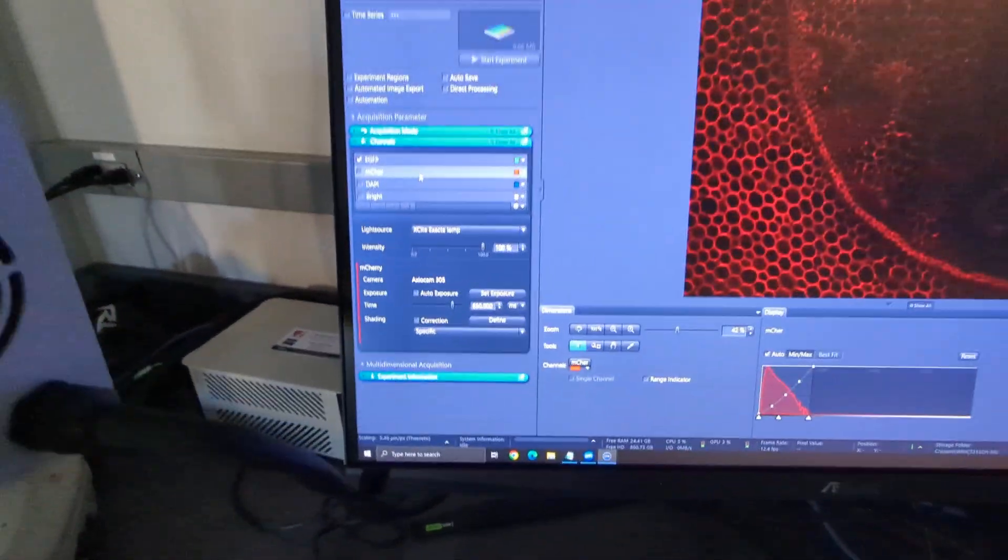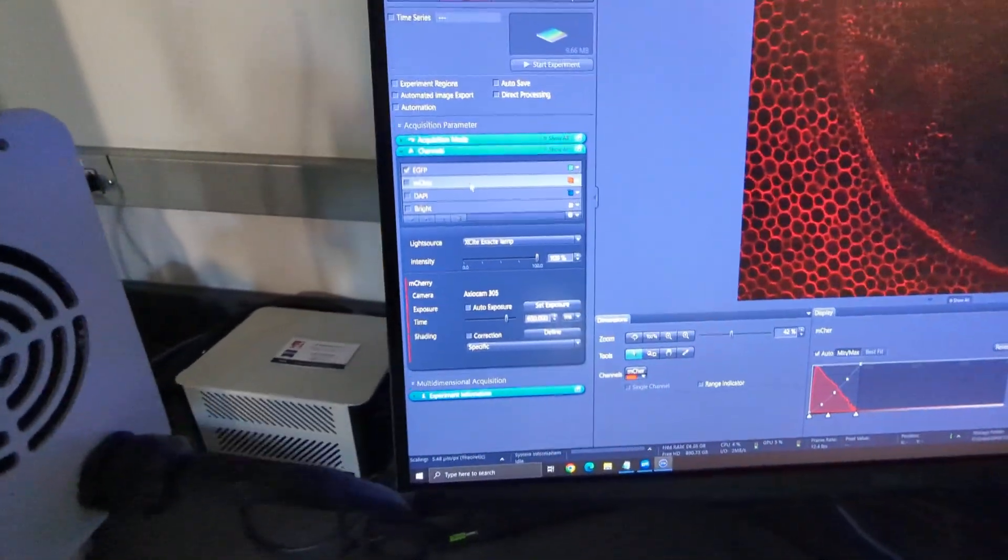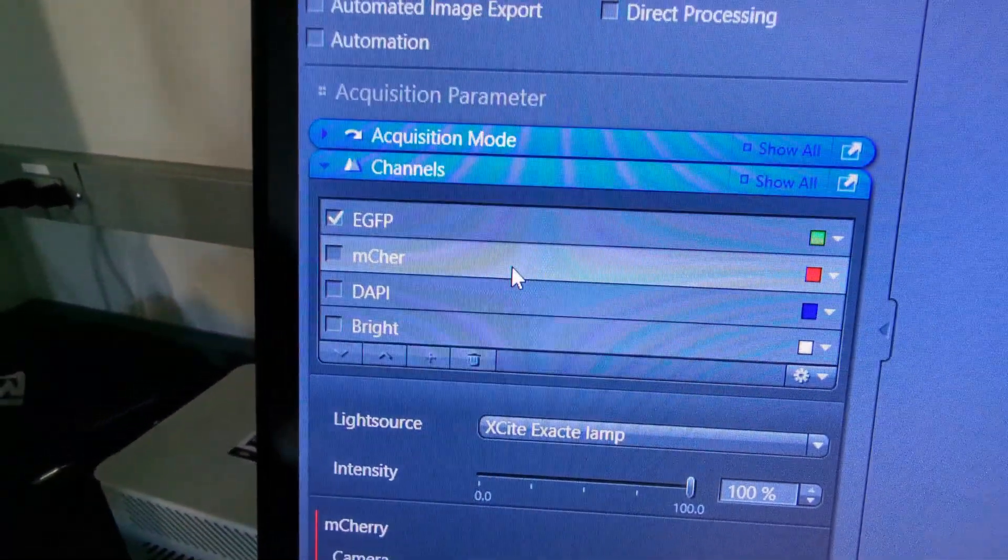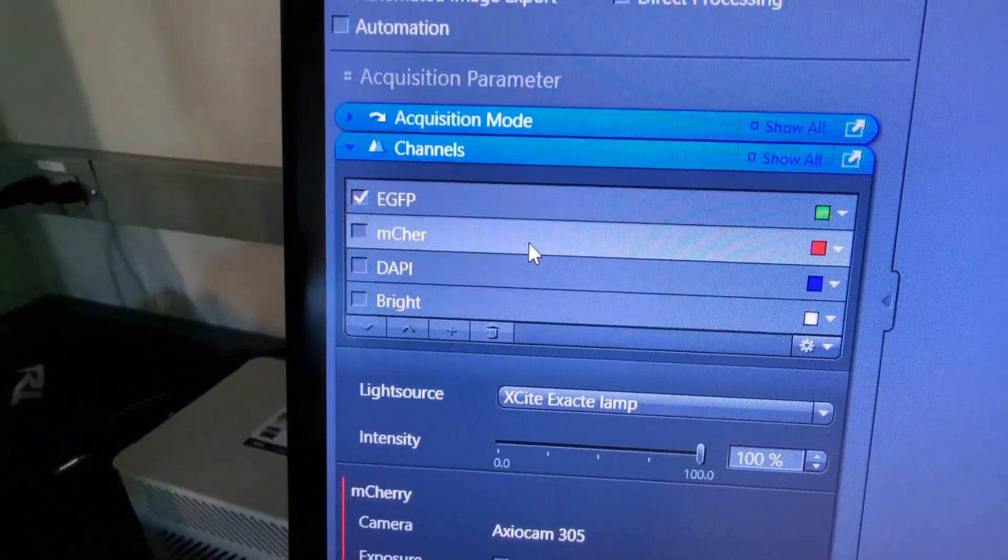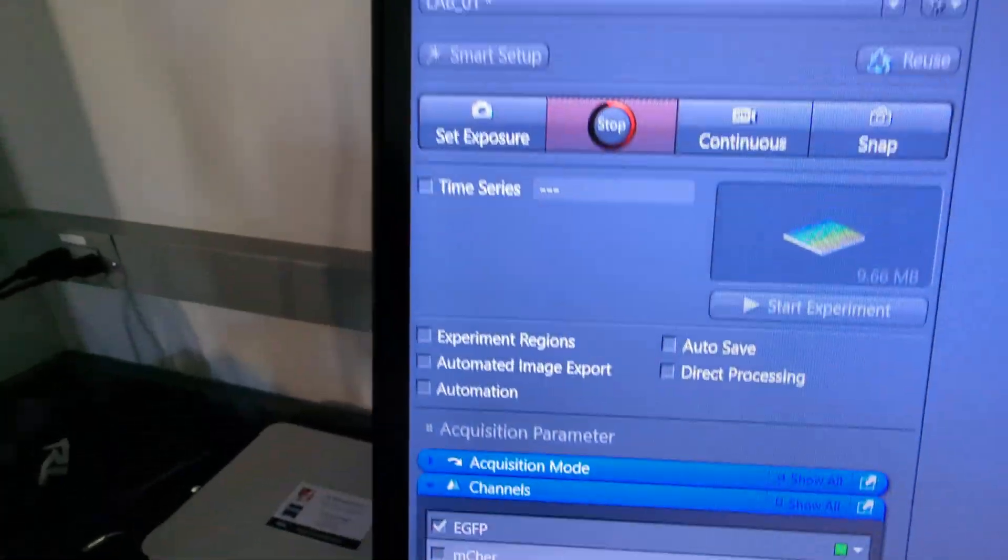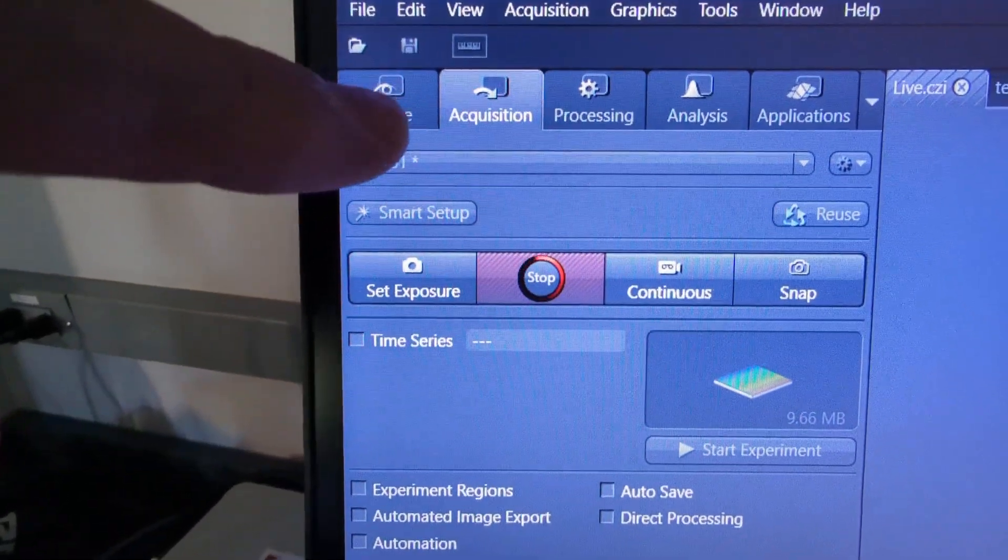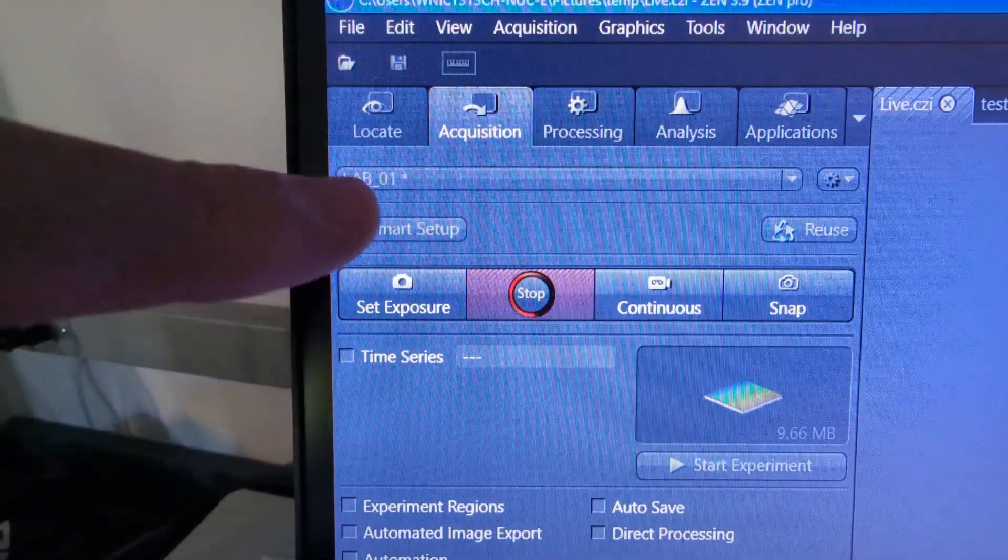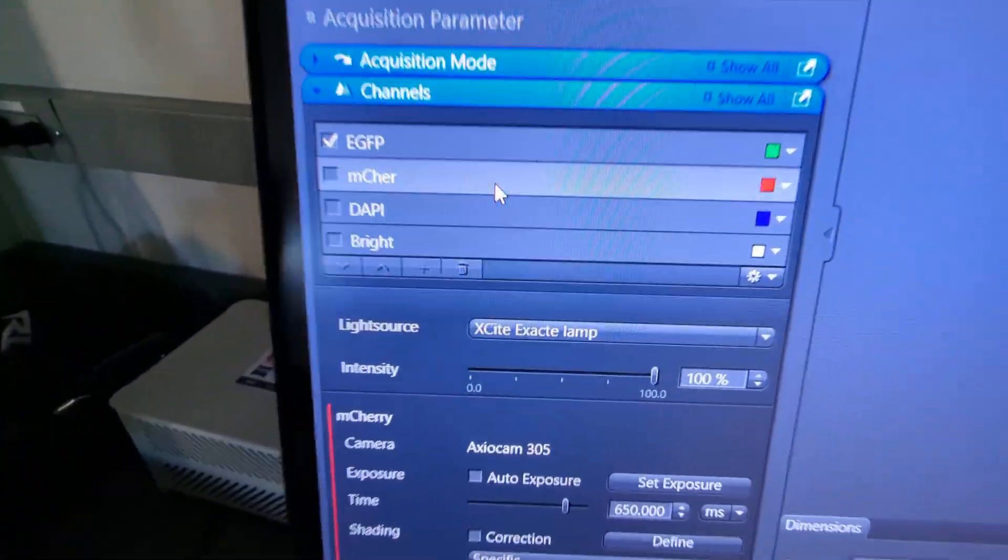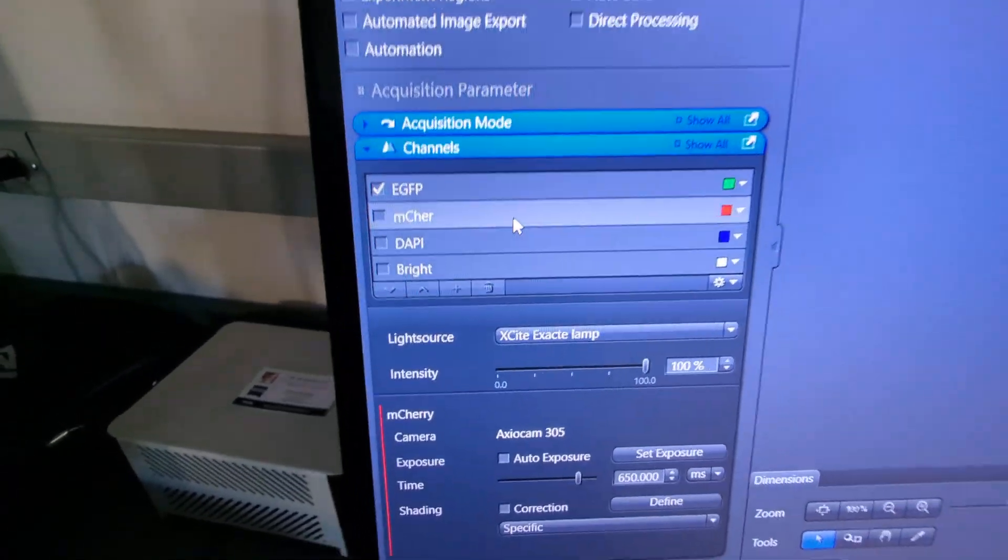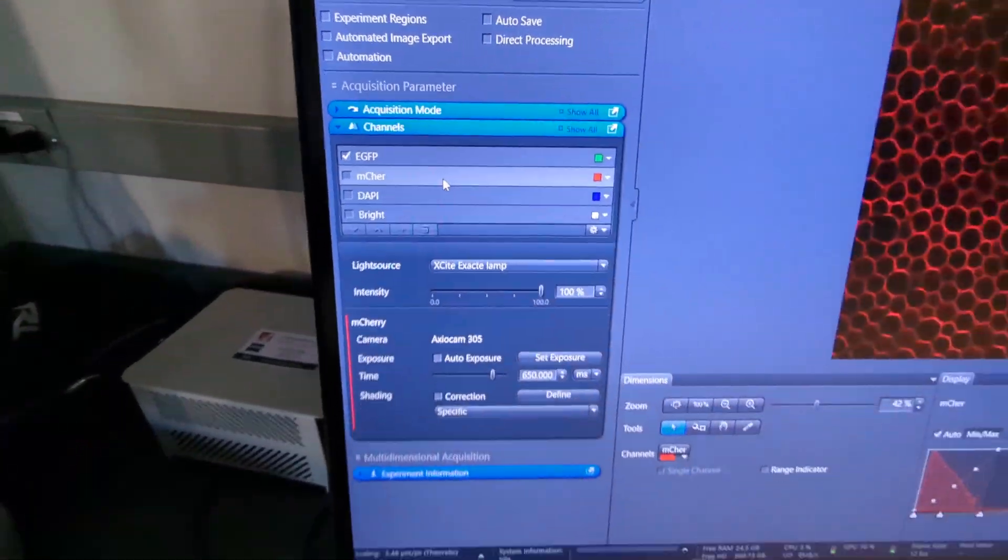There's my m cherry, it automatically, these are colored. So that's the difference between being in the locate tab or the acquisition tab, is that these are automatically colored channels so you don't have to worry about that.